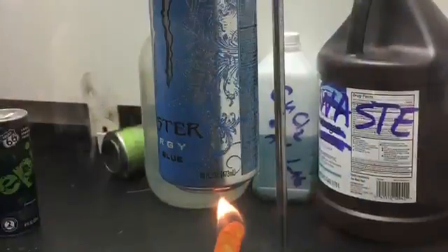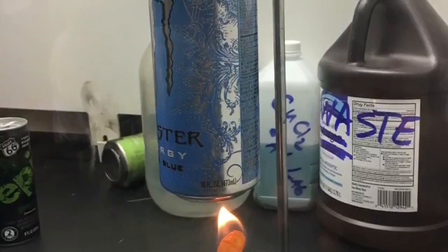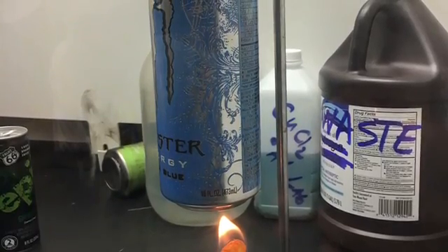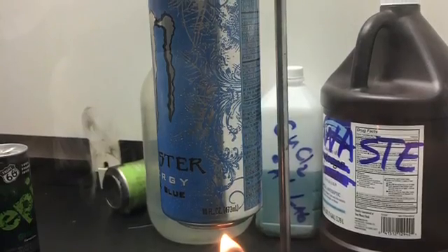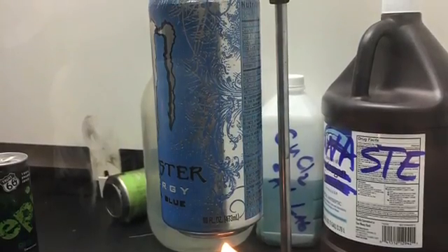We set up the procedure with paper towels, a monster can, a Cheeto, and a metal ring clamp. We chose a Cheeto, then measured its mass. We took the Cheeto and punctured it with a large paper clip. We placed the monster can on the metal ring clamp and placed the punctured Cheeto under it.